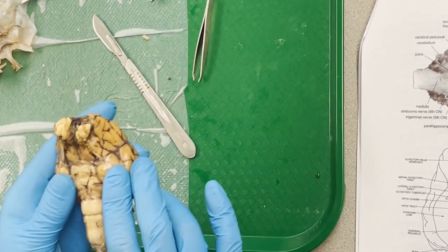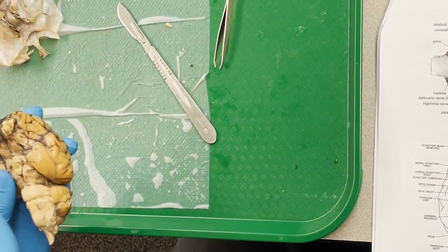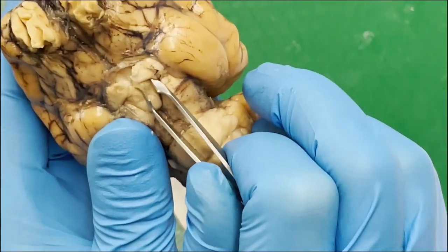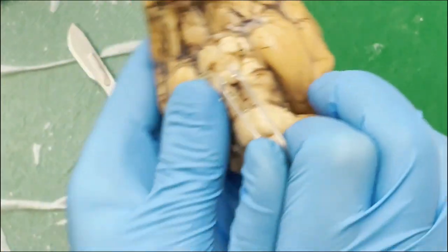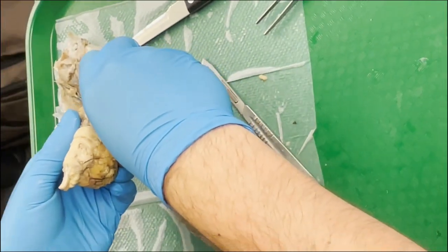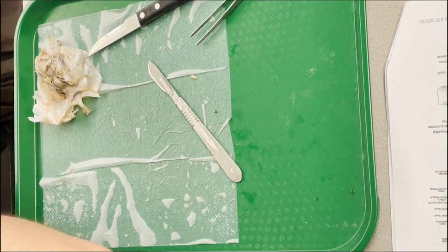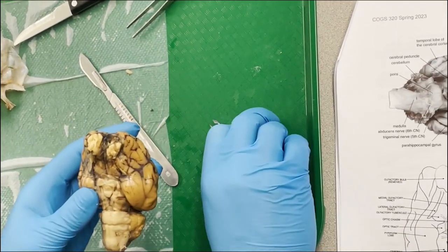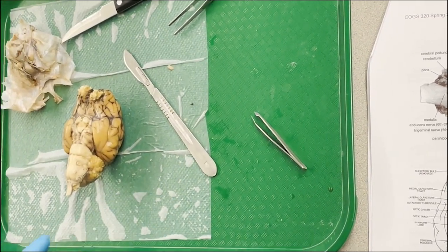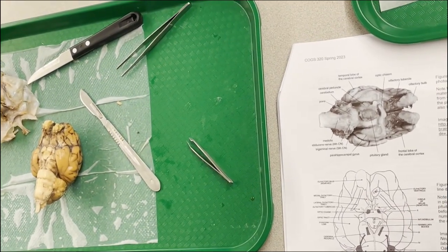If you look closely at the brain tissue, there'll be this weird little hole pocket right in the middle there. It's gonna be very tiny, but we could point it out basically right in there. And for anybody who happens to take a look, it's basically right about there. Very, very tiny. Behind the optic nerve. So the infundibulum, it's the way through which the pituitary connects to the rest of the brain.